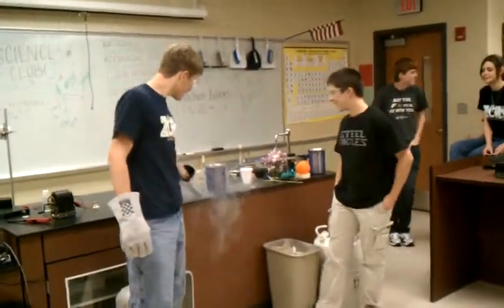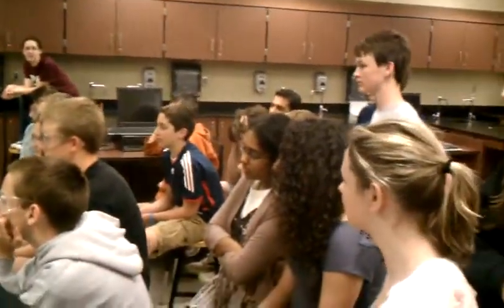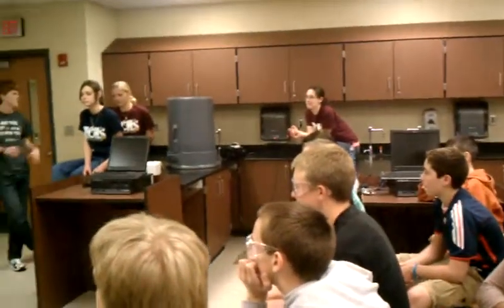Alright, does anyone see this mist going on around here? Does anyone have a guess what that might be? It's the nitrogen evaporating after it boils. Alright, well it's good because it's boiling. This is definitely boiling. But what's coming out is the nitrogen.